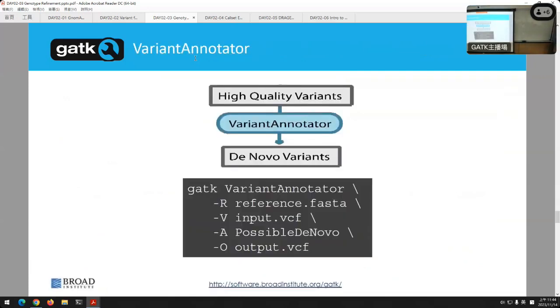There's lots of tools to do variant annotation. The one I'm showing you here is one built into the GATK. It doesn't do biological annotation that Emma was talking about in terms of deleterious or anything to do with frame shifts. This is just to note that you might find a site, a position where you see what looks to be a Mendelian violation, and you can put that up in the info field by running this.